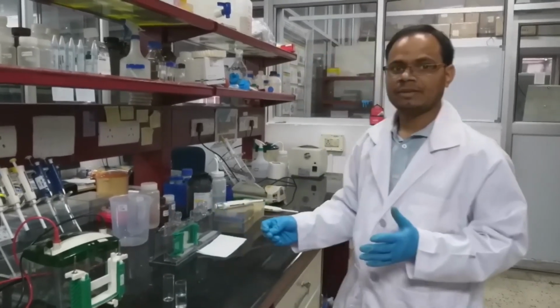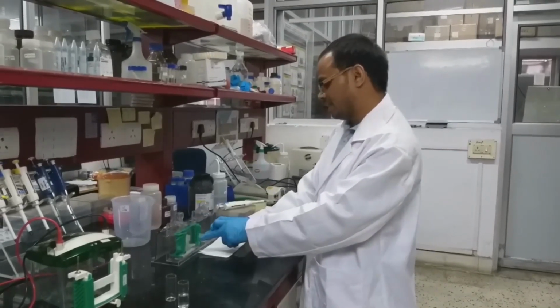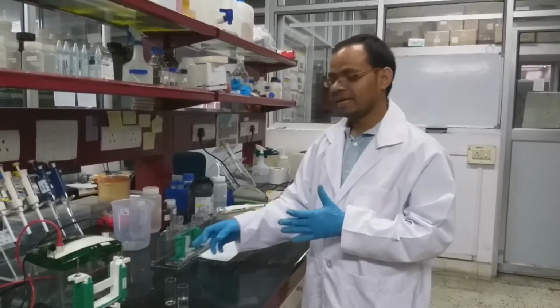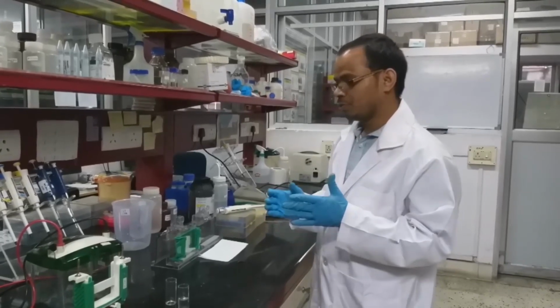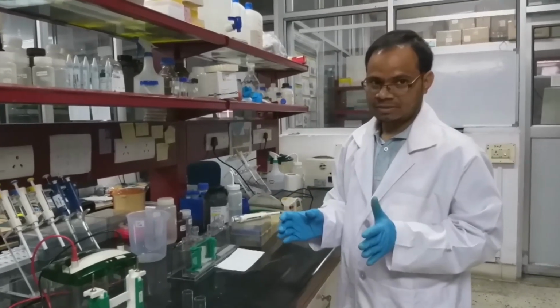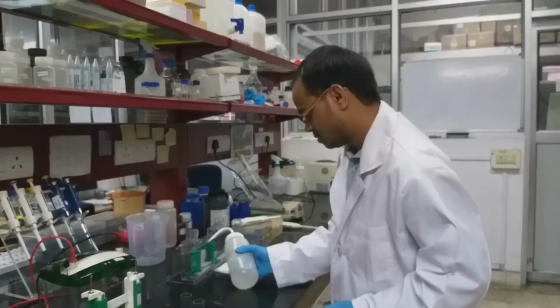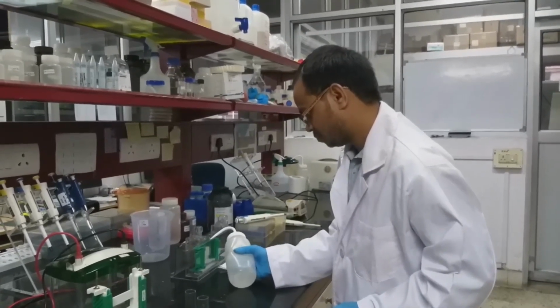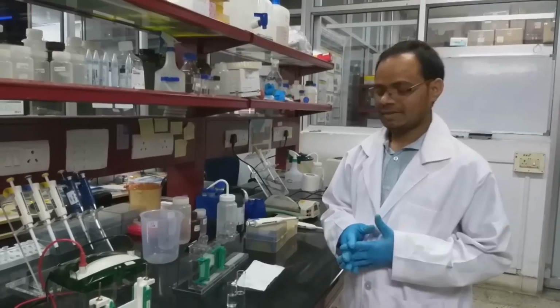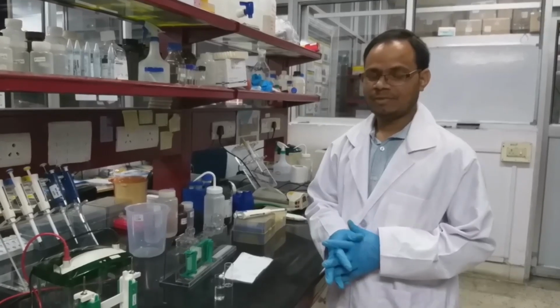So we have to check that we perfectly set up this one, then there should not be any leakage. But if there is any leakage, your resolving gel may leak out and you will get nothing. So in that case, we have to check it prior to pouring the gel, whether it is okay or not. So I am going to use milky water, after checking the gel, whether there is any leakage or not. So we moved forward for preparing a resolving gel.